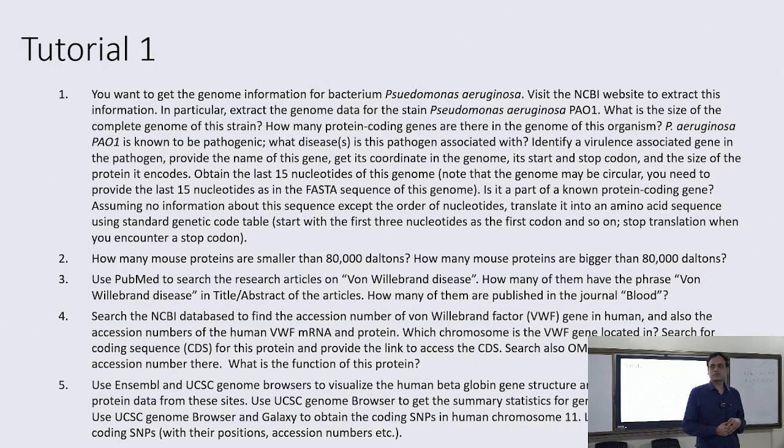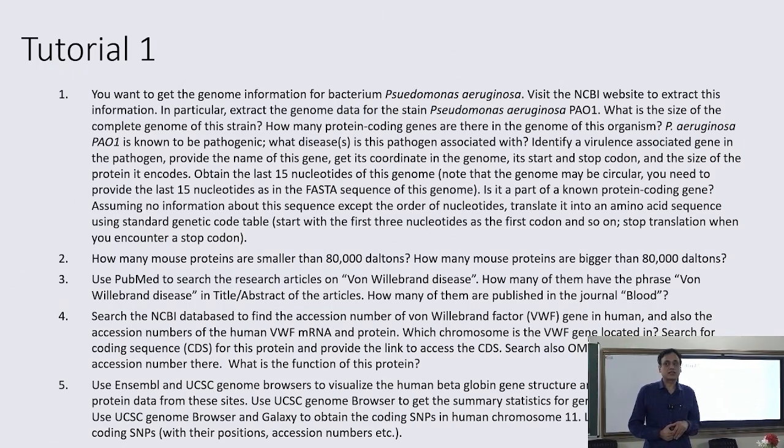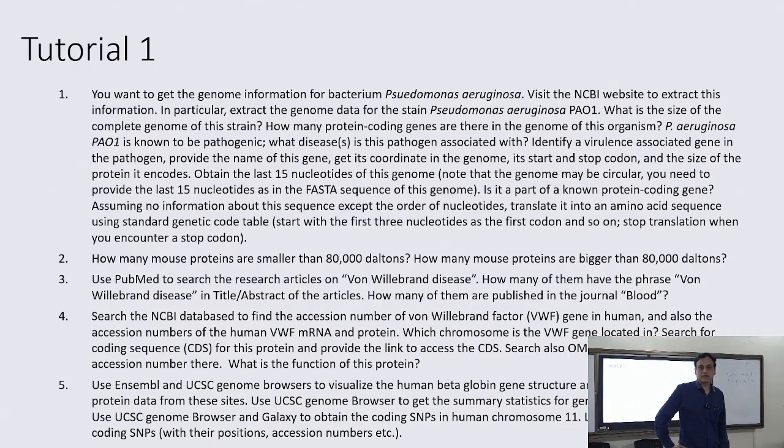And also it should help you in identifying genes that are associated with virulence. So yeah, try it. Are you able to? Okay. Okay, so yeah, you're good actually.